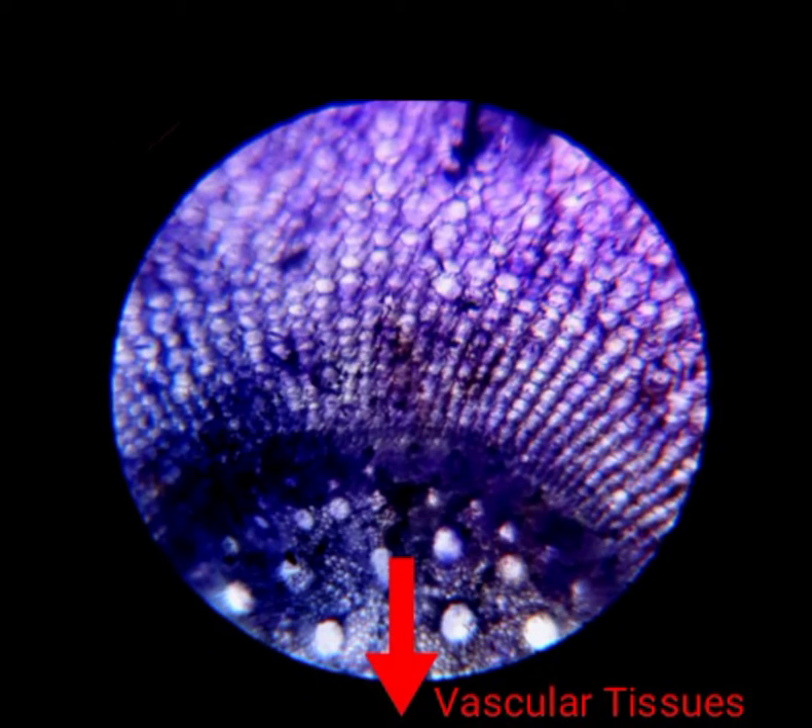Now you can see the xylem and phloem vessels of the root in the middle of the section.